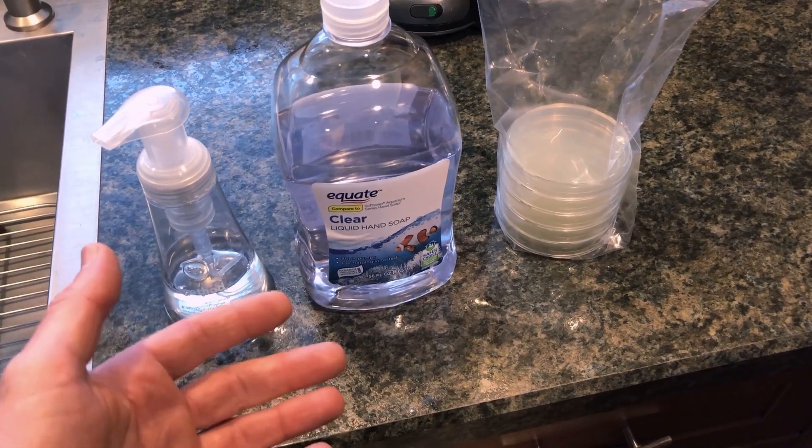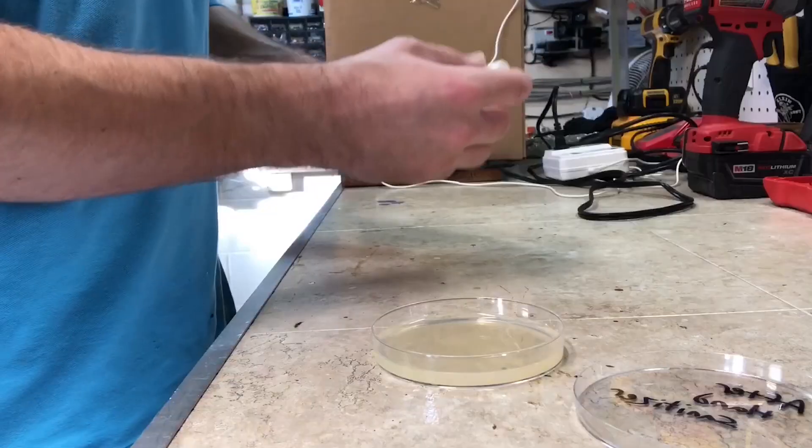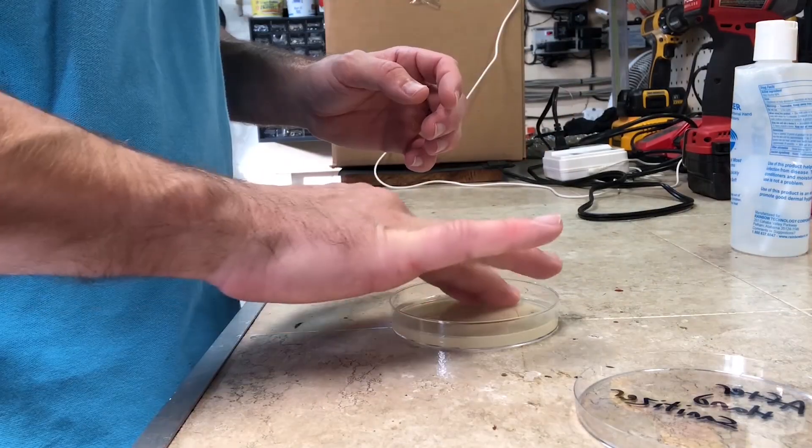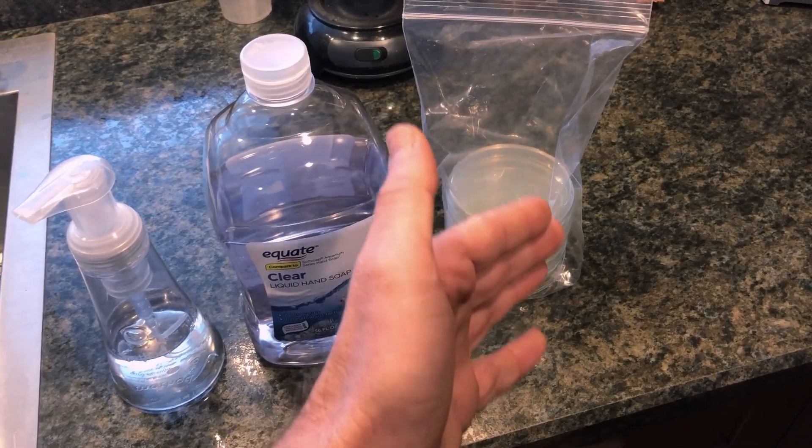In a previous video, I tested hand sanitizer and hand washing with soap and water just to compare and see how effective those methods actually are at cleanliness. I actually used the same soap you see sitting here, and I also used the same nutrient agar plates you see sitting over here. I'm going to talk about those in just a second.